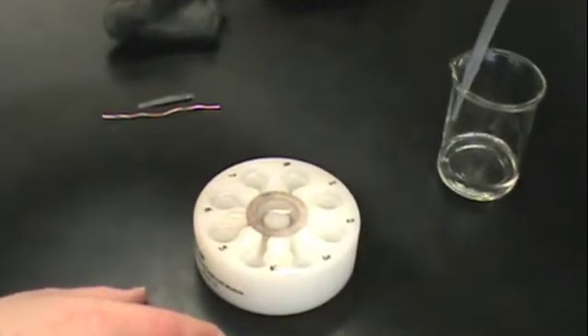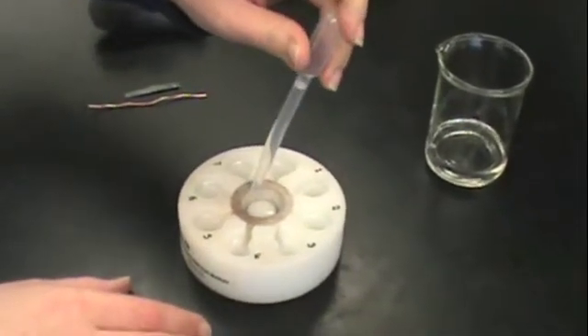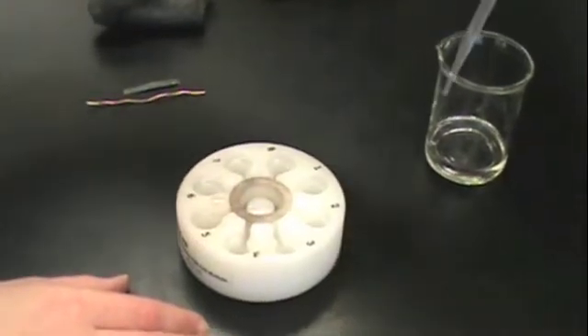Once you have removed the solution from the outer wells, you will also want to remove the solution from the central well, which is your salt bridge.